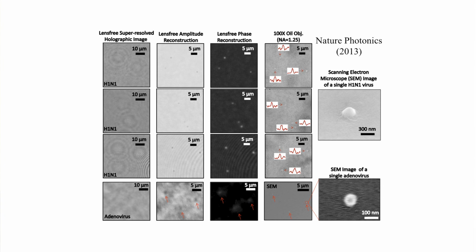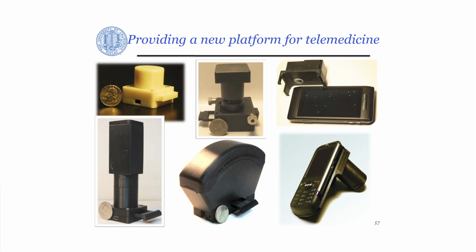These are technologies that you can leverage for, for instance, viral load measurements. Using some disposable microchips that are specifically functionalized for certain viruses, you can actually determine the viral load of a patient with these disposable lens-free imager-based technologies that you can take, again, into your pocket for field imaging. Everything that I've shown you so far was bright field and holographic. So there was no label. The specificity was coming from surface functionalization, either of a microfluidic device or certain nanoparticles, so that you bring in specificity and sensitivity to your imaging system.